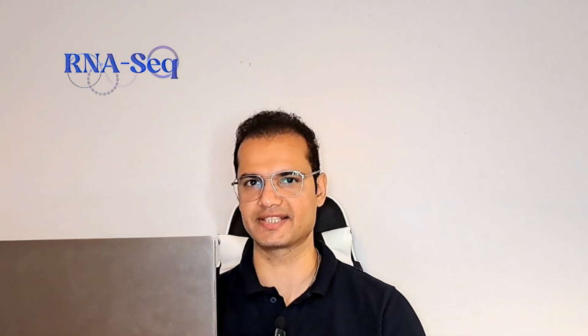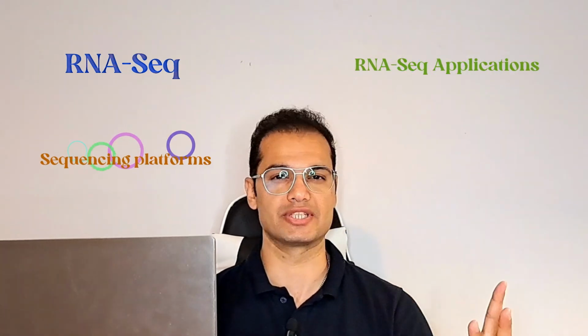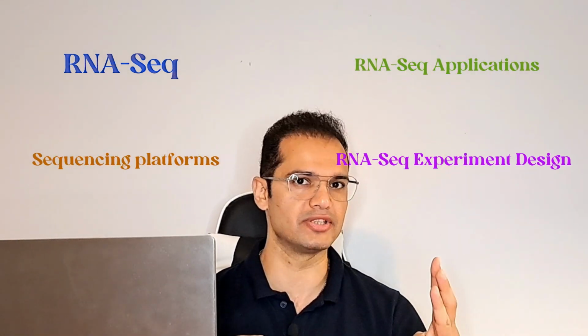Hi, in this video I want to give an introduction about RNA-Seq, its applications, sequencing platforms, and RNA-Seq experiment design.